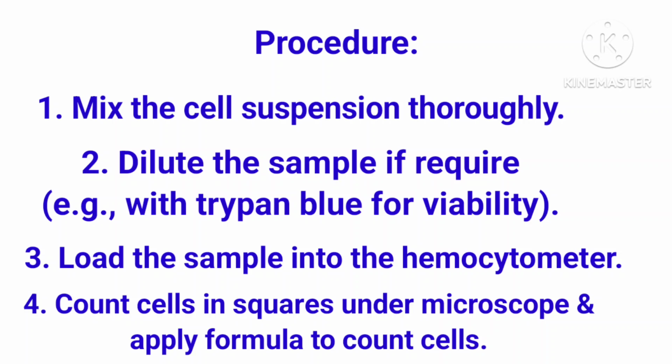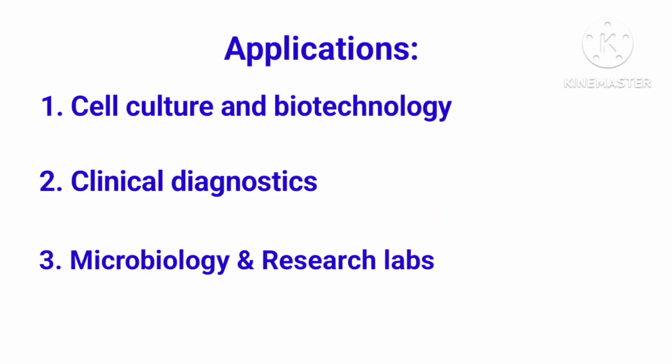Coming to the applications, it is most commonly used in biotechnology and cell culture laboratories. It is actually a manual method of counting the cells. Most labs do have automated equipment. It is also used in clinical diagnostics for counting blood cells and also in microbiology and research laboratories.